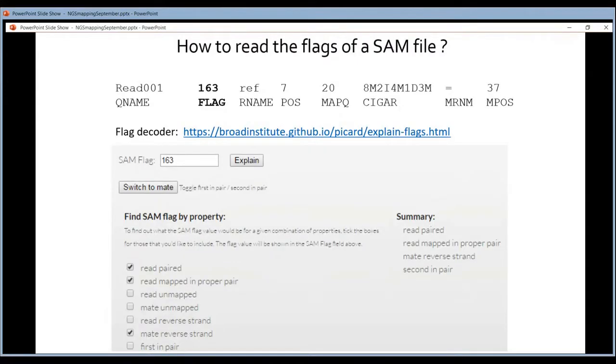First, the flag. Flags are always numbers like 163. What does it mean? There is a tool from the Broad Institute, a website, where you can type in the flag and then it will tell you what it means. So every flag has a special meaning. This one, 163, means this was paired-end sequencing. The two reads could both be mapped. They could be mapped in each other's vicinity and on opposite strands. That's what 163 means. So that's a good one. So all these flags have a meaning.